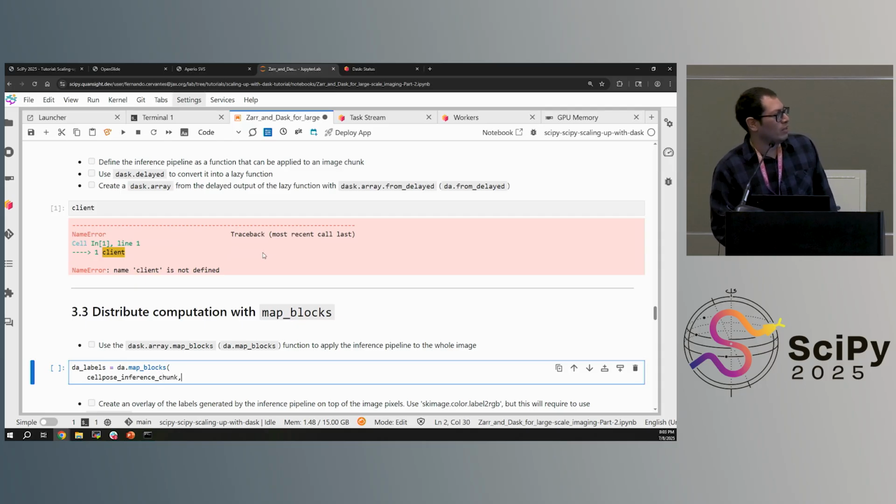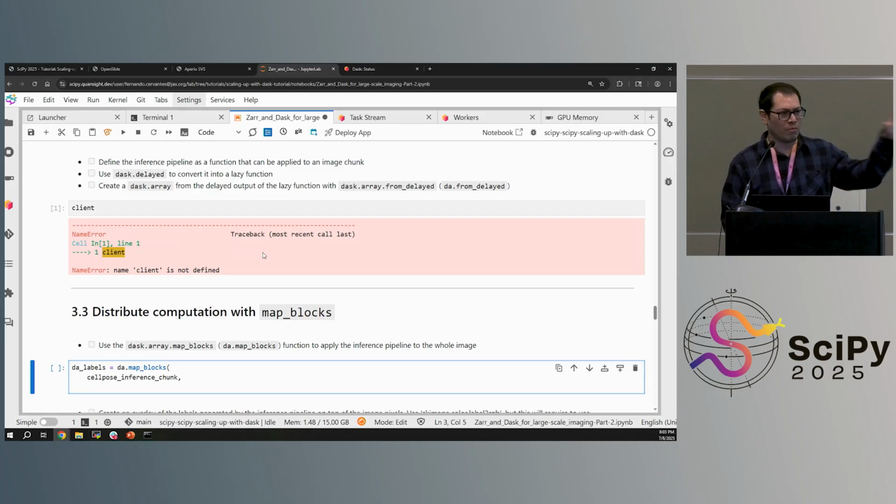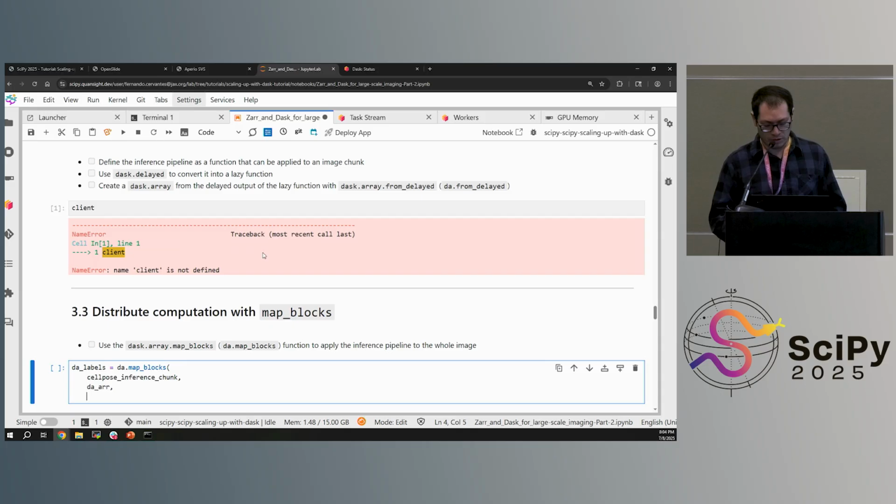We are going to define the cyto3 model that is good for general purpose segmentation of round, nice objects like nuclei in our case. And this is basically creating the model that we can apply.